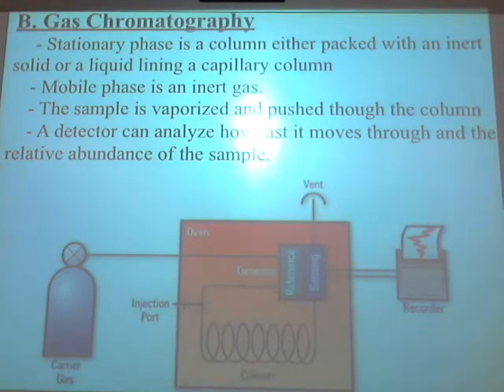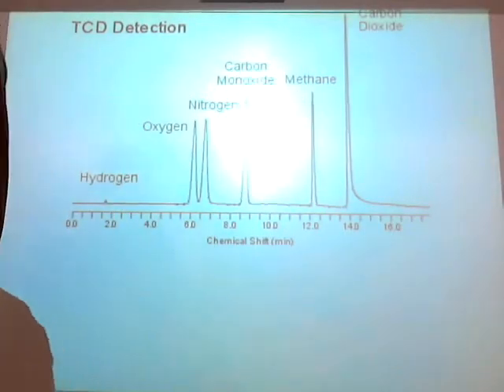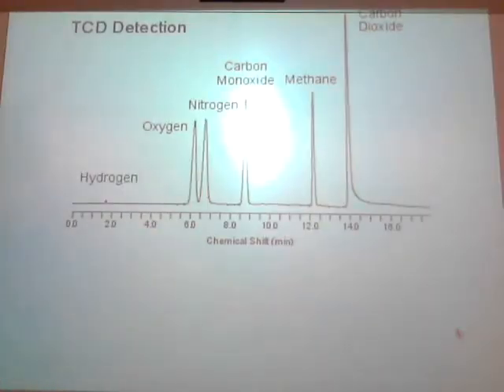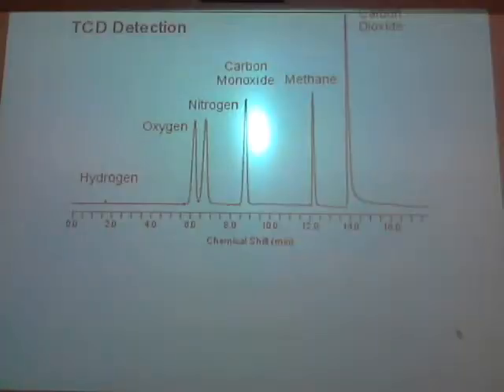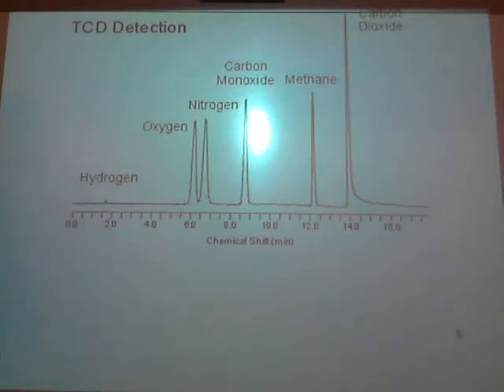So if I asked you to read one of these graphs, I bet you could do it now. Okay, let me show it to you. You have a graph at the bottom there, right? Take a look at this graph. Is it the same one you have? Okay. If I gave you this as a test, and I will, who was the lightest or the most volatile component? Hydrogen. That makes complete sense because it is, from the periodic table, the lightest as well. It'll go through the fastest. It came out in 2 minutes.